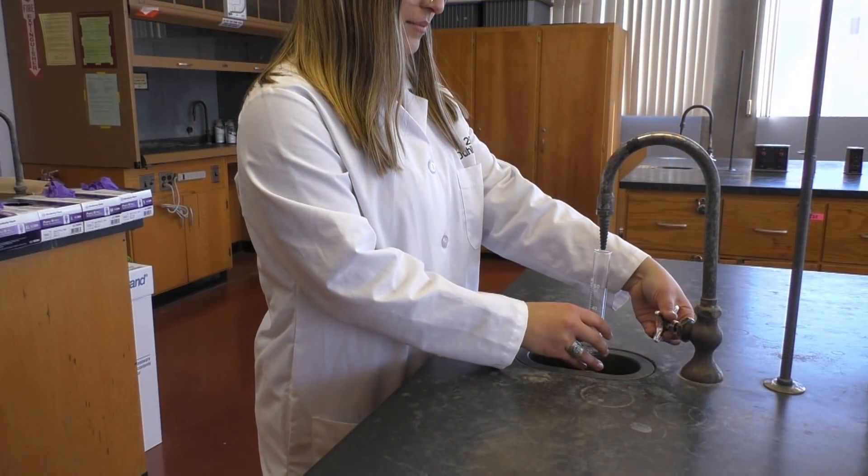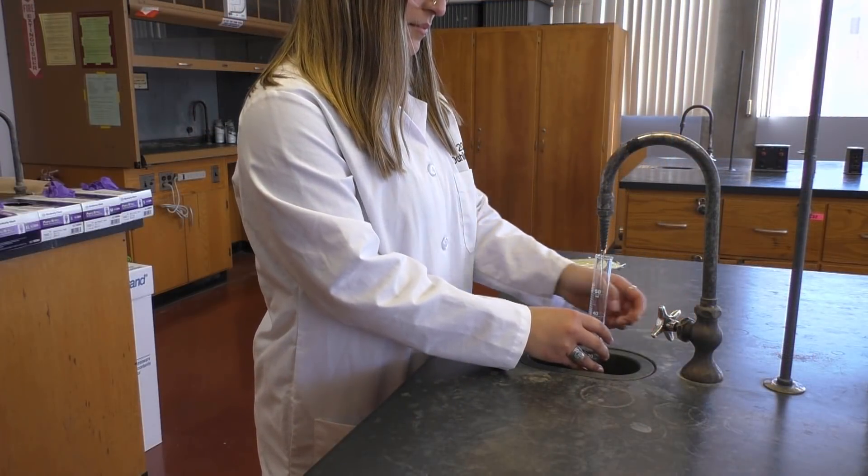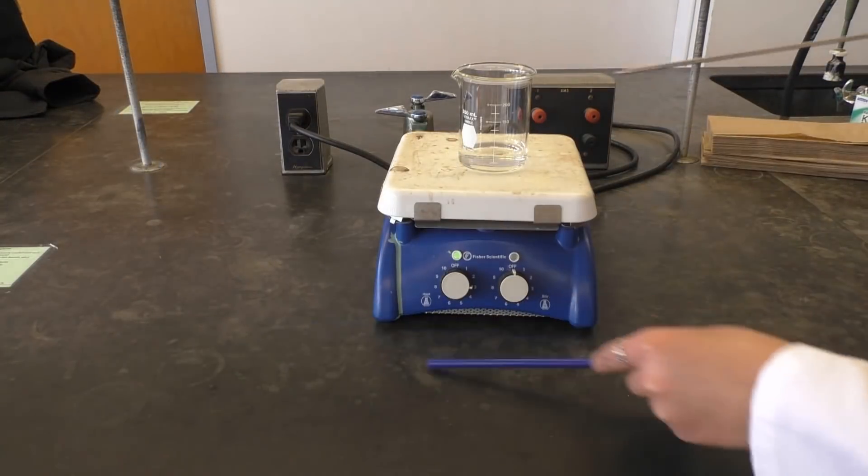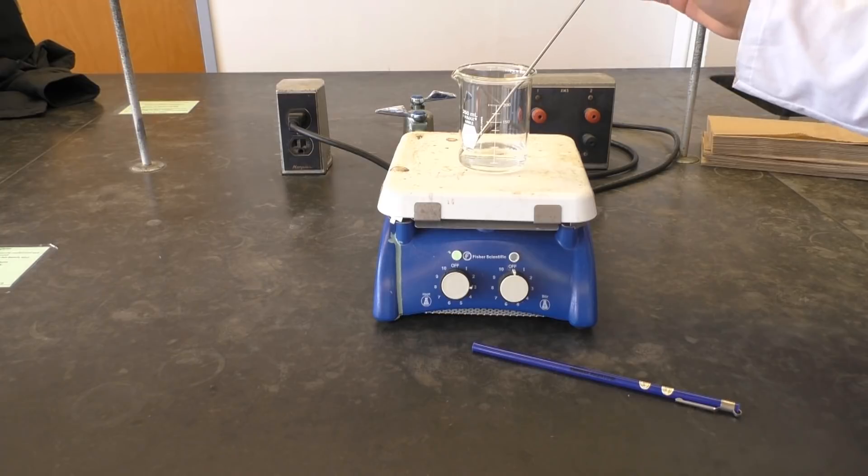While your water is equilibrating, you need to obtain some hot water. So measure out another 50 mL sample of DI water and heat it on a plate until it reaches between 60 and 70 degrees Celsius.